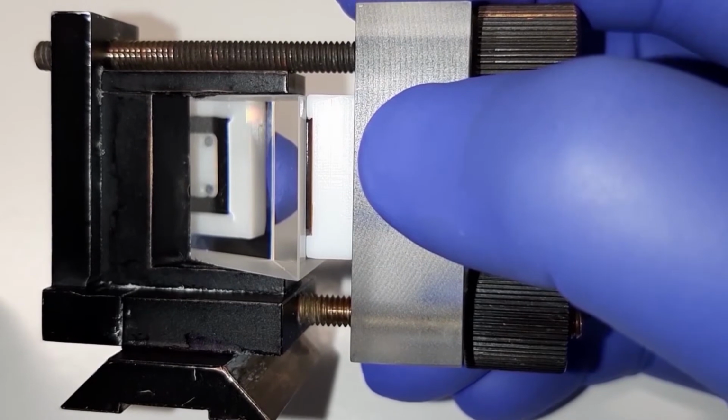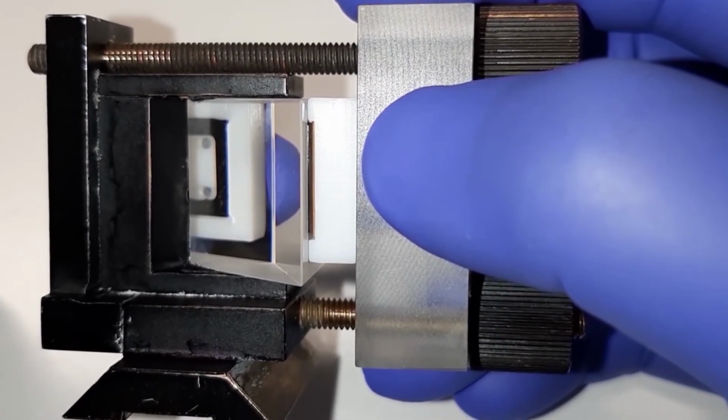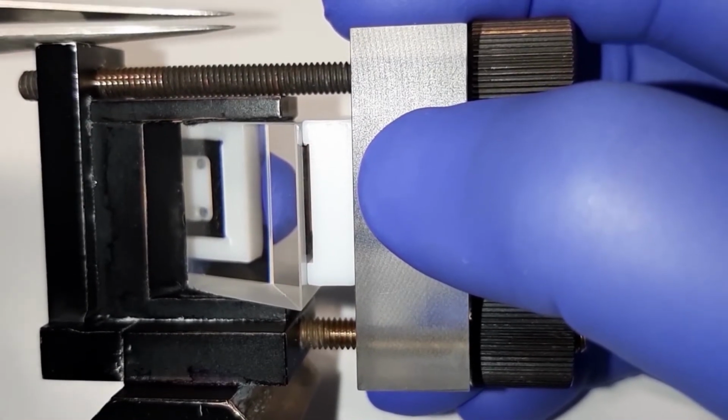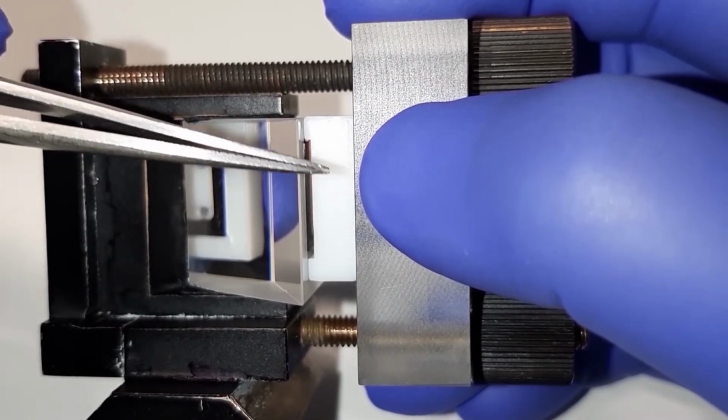And now you may see the prism which is already mounted with the flow cell. So this is the prism and this is the flow cell.